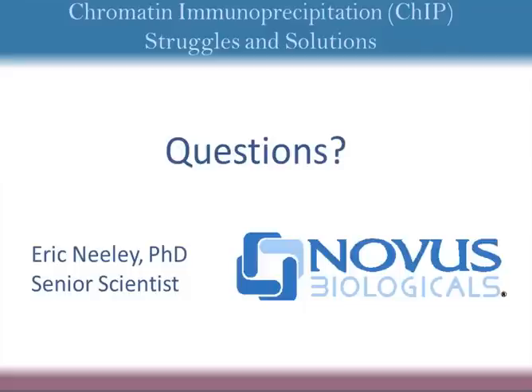So if you use that antibody that isn't working well right now in a native IP, and then maybe even use a second antibody that is known to work well in Western blot for the same target, and you see a pure, clean result, then you'll know it is working well and possibly will work well for the ChIP in the native state. Okay.